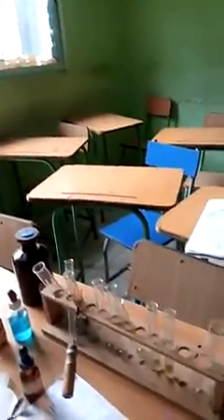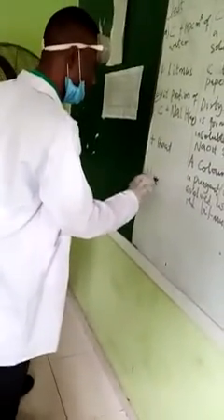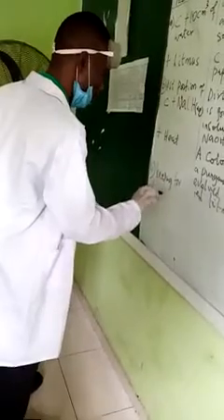Alright, so we are done with that now. Okay, the next thing they say is keep for a few minutes. So we come to this place. This is B, II. Say keeping for a few minutes.